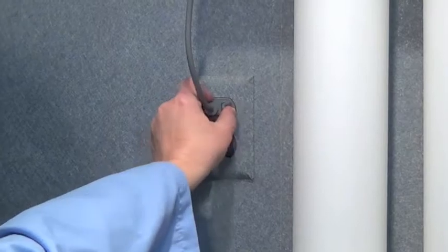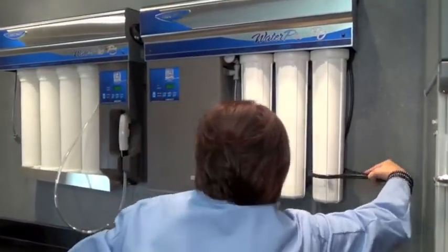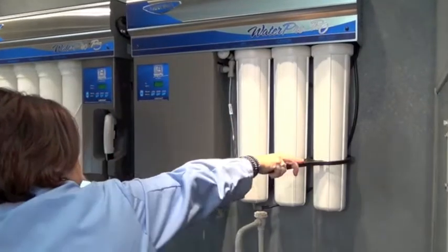Unplug the unit from the electrical outlet. With the spanner wrench provided, remove the first bowl on the right to replace the pre-filter.